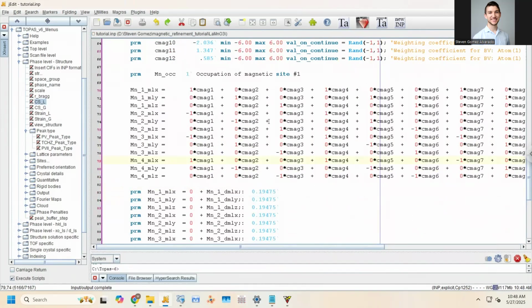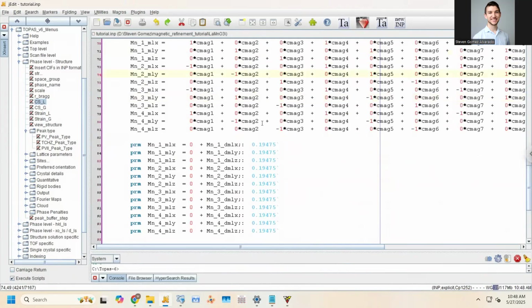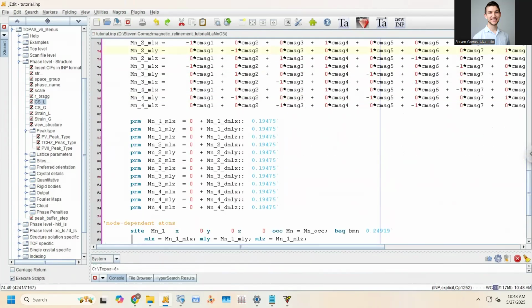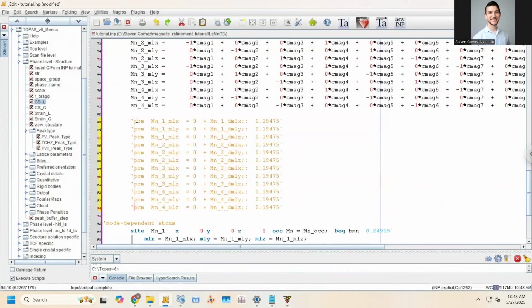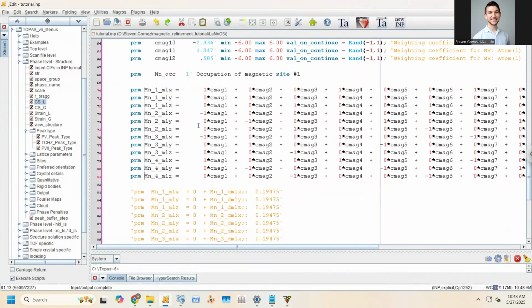What else? Oh yeah, even crazier. None of these are used. So this whole block of code is just a waste. And then all these variables don't have the right parameter keyword before them.